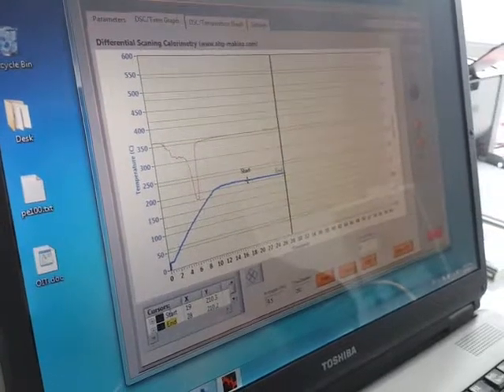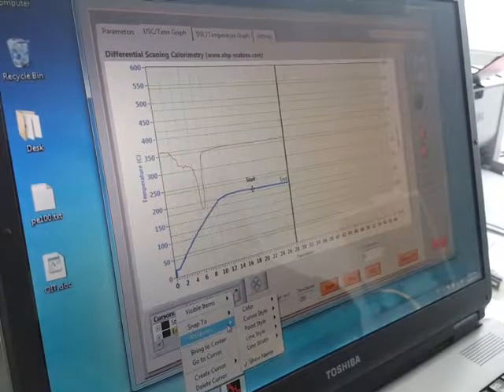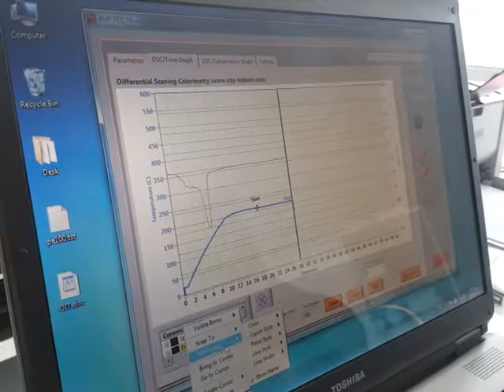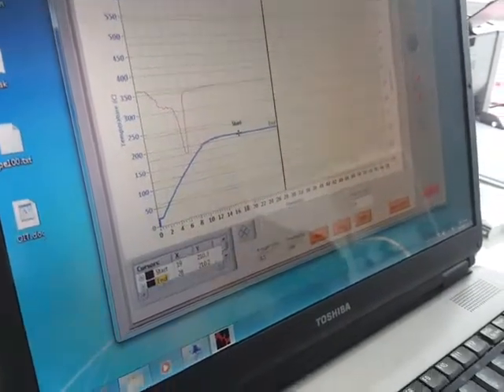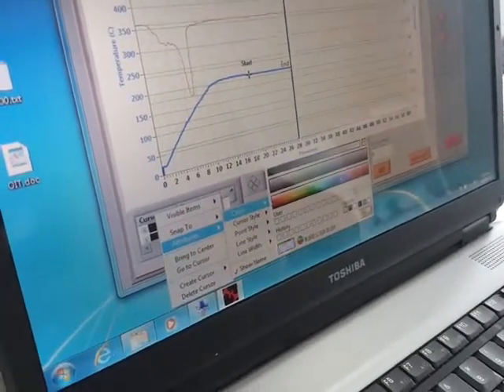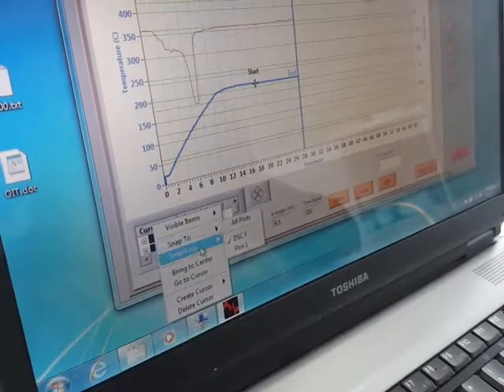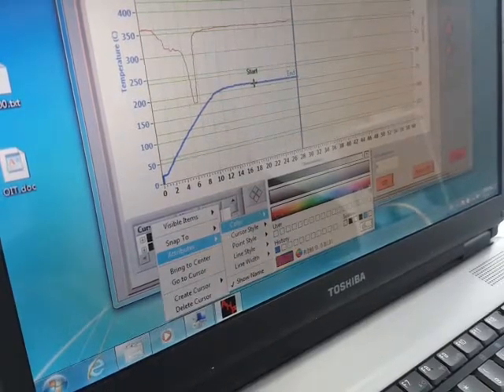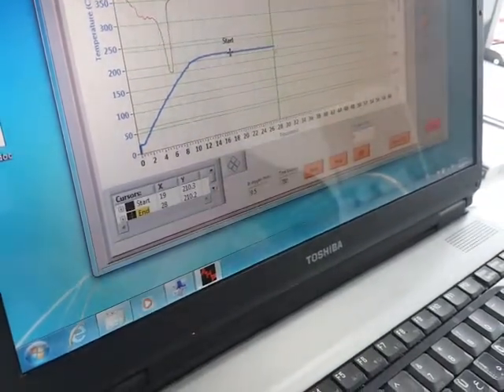This is the OIT measurement. Also, the operator has some capabilities to change the cursor specifications, these cursor attributes, like color. For example, the end line. This is an end line cursor. You can easily change the attributes such as color. It's black now. I can easily change it to blue. You see, whatever the operator wants to change in cursors, changing it to green. You see.